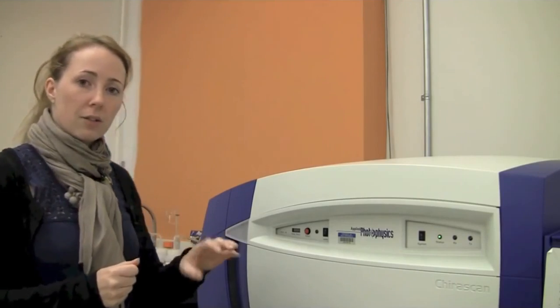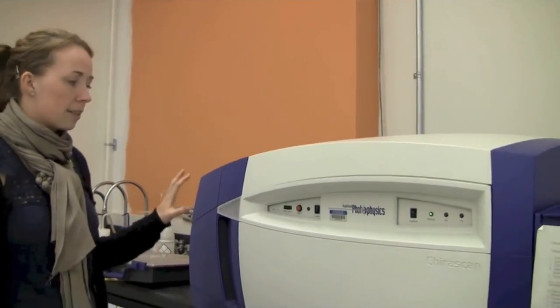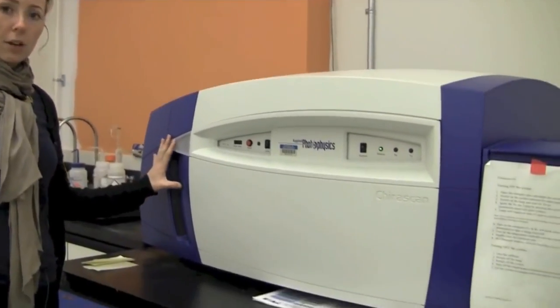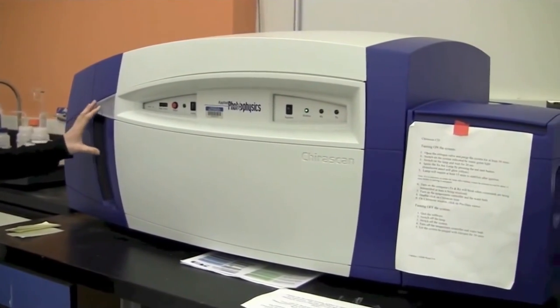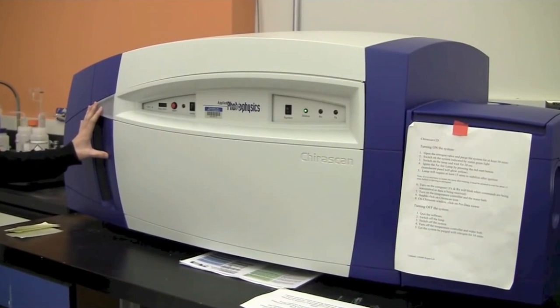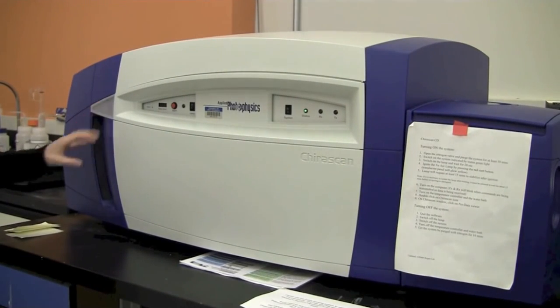For this instrument, starting from the left, it has the light source out here on the left side. It's a 150 watt xenon lamp producing ozone.